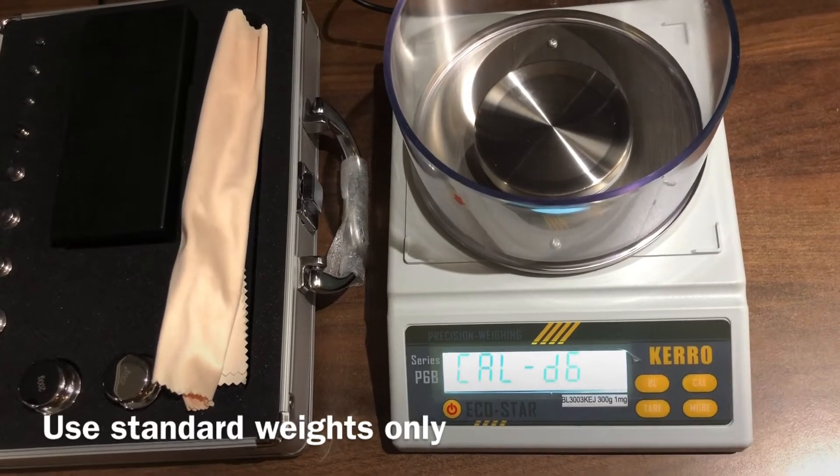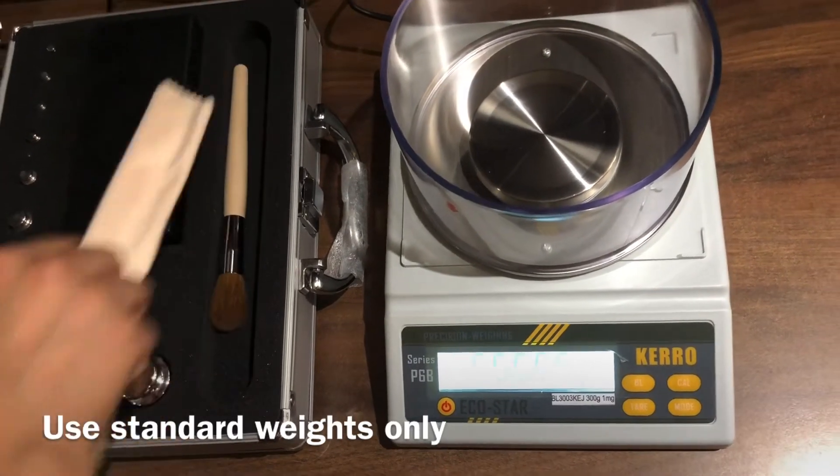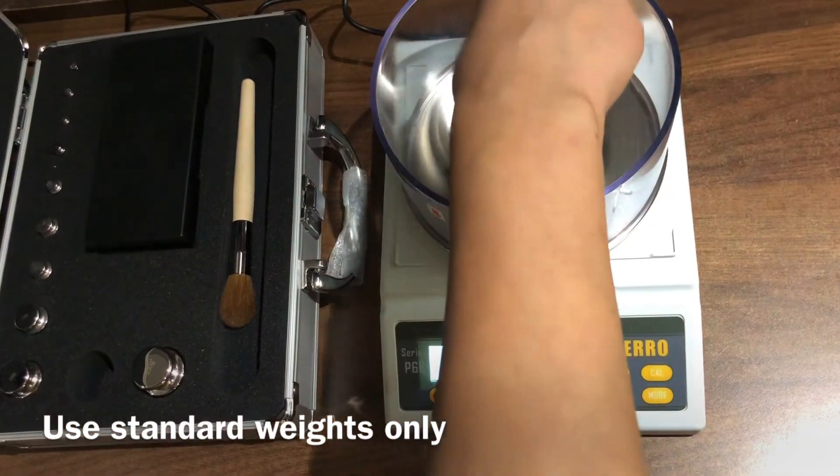In D6 mode, it will ask for 200 grams. Put a standard weight of 200 grams over the pan.